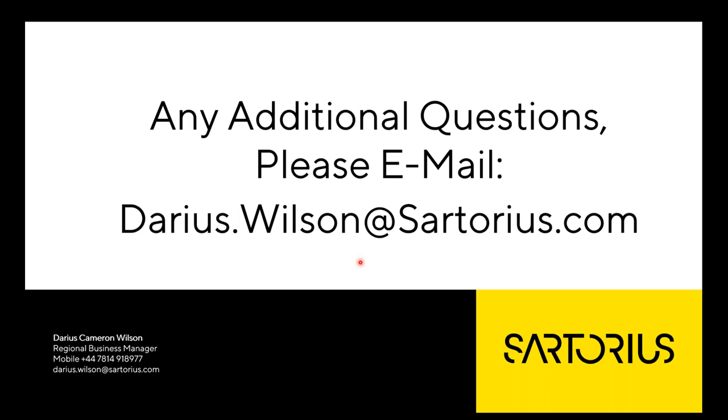Yes, it is possible to do that. For that approach, you would take the confluency mask from the Incucyte, and then you can export that mask and do further analysis in, for example, ImageJ. In ImageJ, you're able to obtain the counts. And I believe you should also be able to get the area or the average areas using ImageJ macros, for example. So you can't do it on the Incucyte itself, but you can do it by exporting the masks.